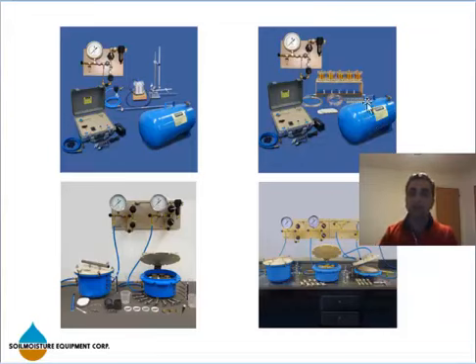Here we have 1425, that is a Tempe cell system. Here we have 5 Tempe cells that are 6 centimeter tall, or can be 3 centimeter. We have different options. And the diameter is 2 1/4 inch. Tempe cells are basically miniature pressure extractors. Instead of using this big guy, you use a tiny one.